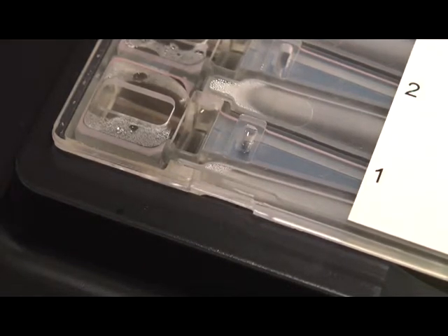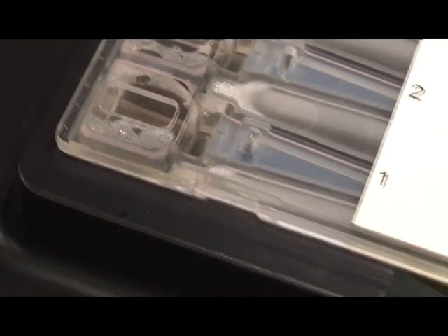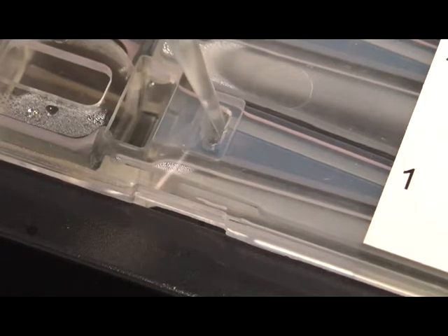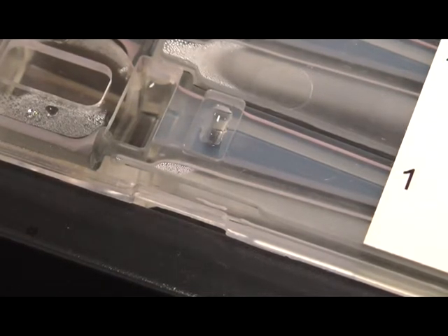Then load 40 microliters of sample or reference ladder. The sample wells are surrounded by agarose walls on the sides and bottom. Pipette samples into the center of the well carefully so as not to pierce the walls or bottom of the well.